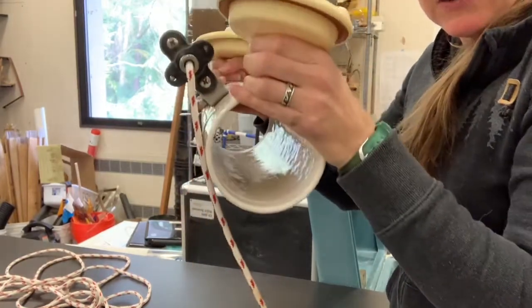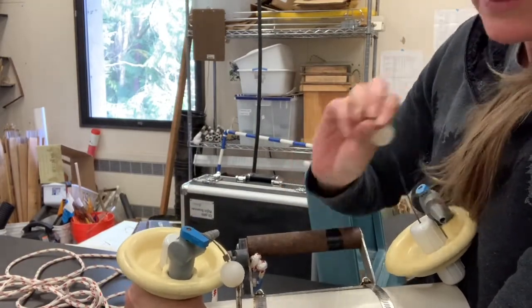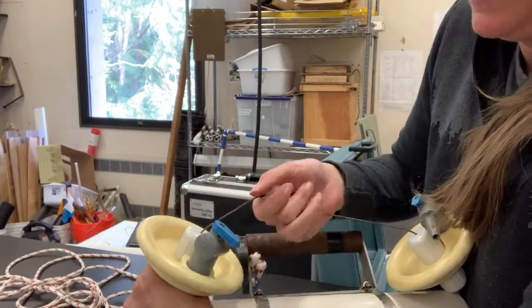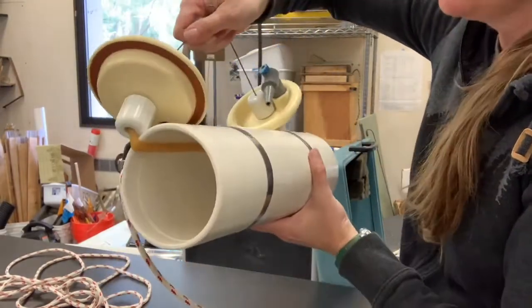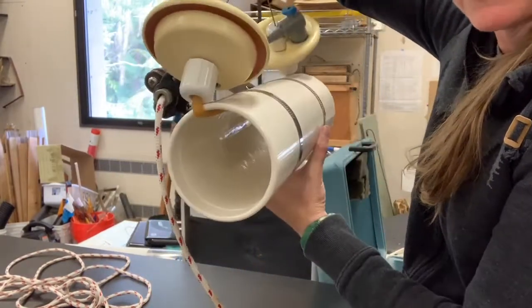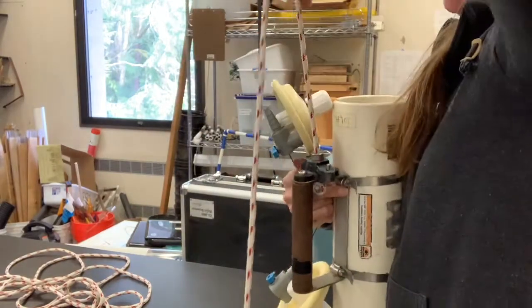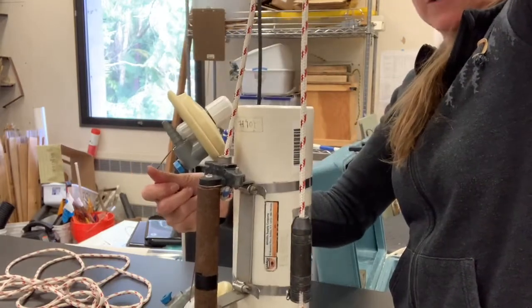So I'm lowering it down in the water column, and the mechanism — the way it's supposed to work — is you put these two little loops through this little pin here and it holds it open. We're just going to pretend I'm holding it open as I'm lowering it down. There are some bottles that lower down kind of horizontal, but this mechanism is supposed to lower it down vertically, so the rope comes off the top and it's lowering, lowering, lowering down to the place where you want to collect.